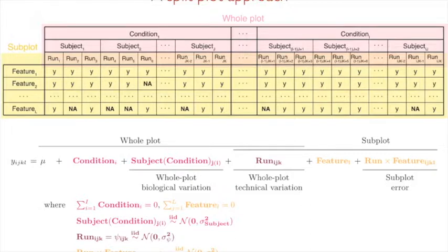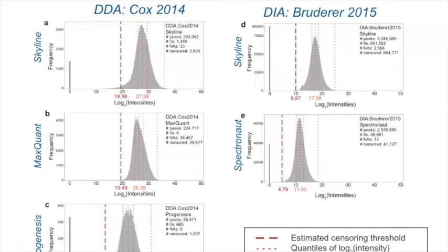Because different data processing tools make different decisions. Well, for good reasons, they optimize for different things. But the fact is that when we have really nice, abundant peaks, most tools will agree. When the peaks are overlapped, low abundant, close to the noise, different tools may make different decisions. So this is a data processing step which Meena has developed, and we found this really necessary and also useful to make it inclusive so that we can actually work with different data processing tools.